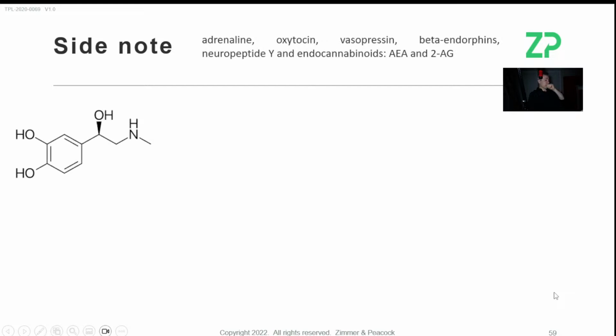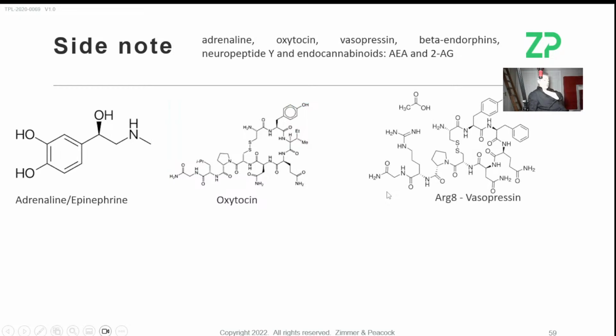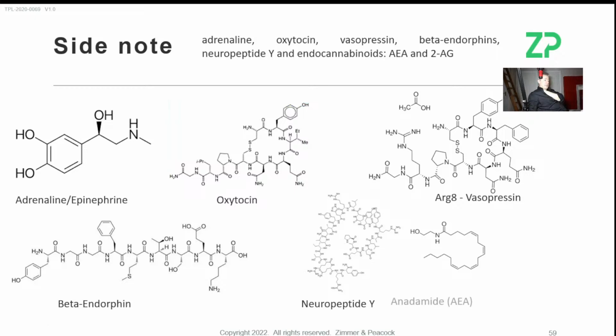I did ask them all about the other hormones. One thing I'd say about adrenaline, or epinephrine, is it is quite detectable by electrochemistry. In a complex human sample, actually I'd find it harder, but if I was just trying to detect this in a clean buffer system without many interferences, it's actually quite easy to detect. I did look at all the other ones, the oxytocin, the vasopressin, the beta endorphin, and also your neuropeptide Y, and then those endocannabinoids.